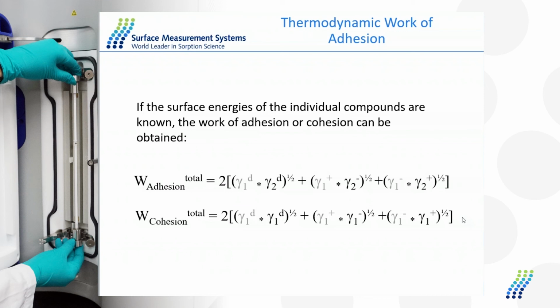Would you recommend using butane or something smaller if our powders are closer to 5 microns? We can run 5 micron powders as is. Our system is not equipped for butane because that's a gas at room temperature. Our instrument is only set up to inject vapors. So the smallest alkane we could use is pentane. We have used pentane, it does work. So from a practical standpoint, you can use pentane up to about dodecane in terms of your straight chain alkanes.